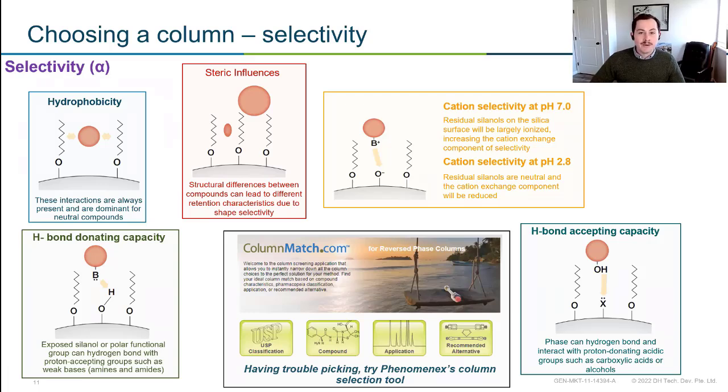So some of the more common techniques that are used would be hydrophobicity. So this is great for neutral compounds versus something like a steric influence. And a steric influence is really more dependent on your compound structure. So different structures will interact differently with that stationary phase. You can then get into something like H bonding, H accepting and H donating capacity. And those are going to work for different compounds. For an H donating, we're talking about sort of amines and amides, more bases, versus H accepting, which we're talking about more acids. But regardless, we really want to choose a column that works for your analytes.